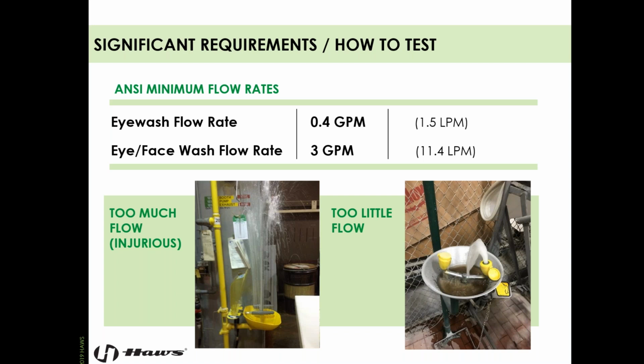There's not enough water coming out of here to sustain this equipment's ability to provide first aid, right? Basically choose which eye you want to save. So too much water, not enough water, both serious issues.